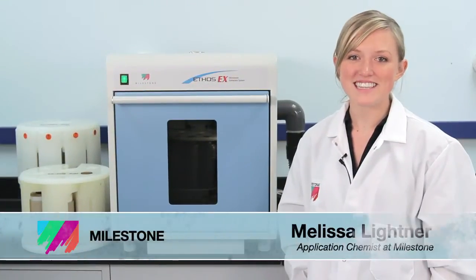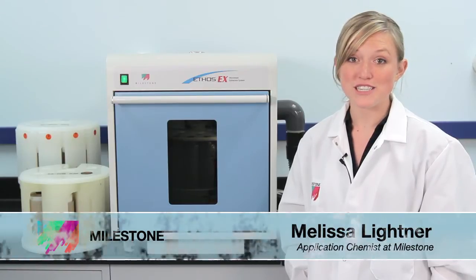Hi, my name is Melissa Leitner with Milestone. More and more labs are switching to microwave assisted extractions due to its high throughput, reduced solvent usage, and higher extraction efficiencies.